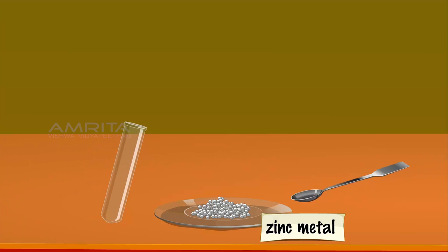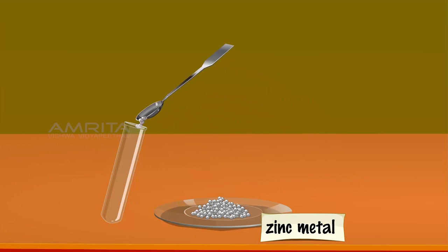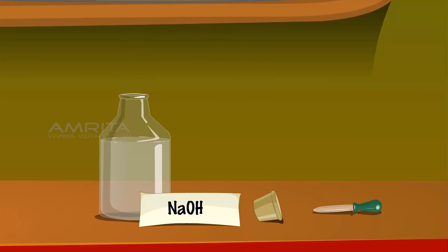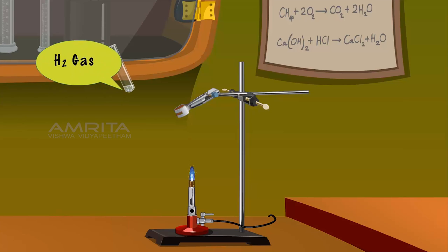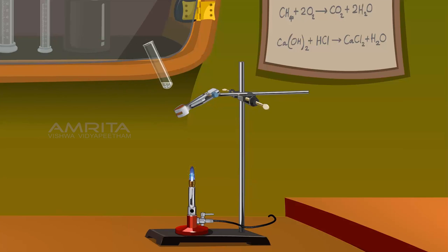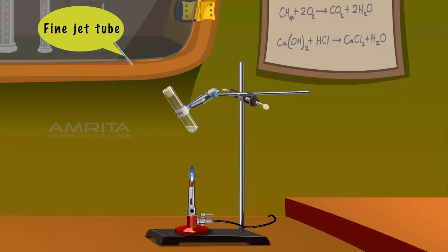Using a spatula, transfer some of the zinc metal from the dish into the test tube. Take a few drops of the NaOH solution from its bottle using the dropper and add this to the test tube containing the zinc metal. Clamp the test tube to the stand, then close the mouth of the test tube with the cork and pass the jet tube through the hole in the cork into the test tube.